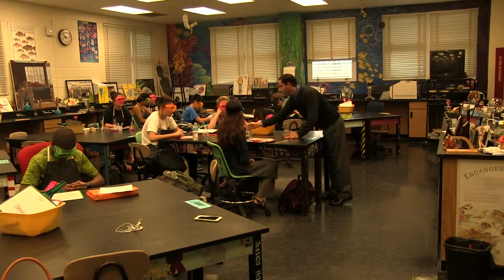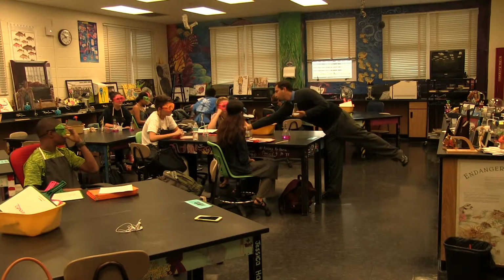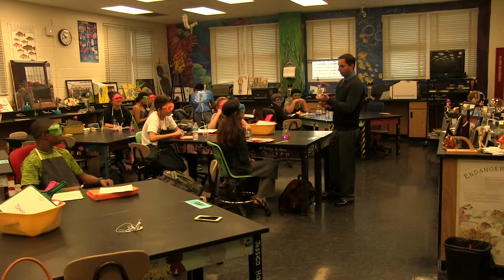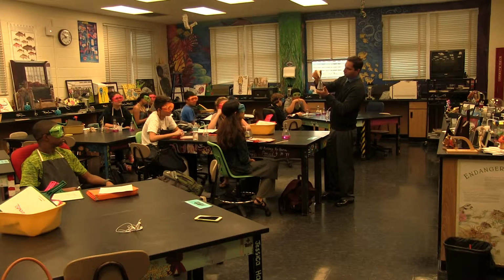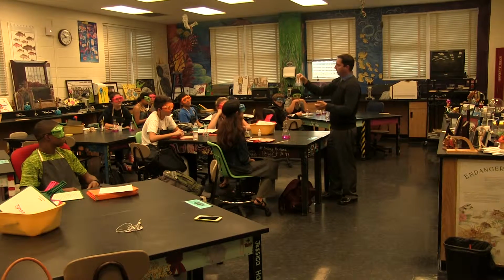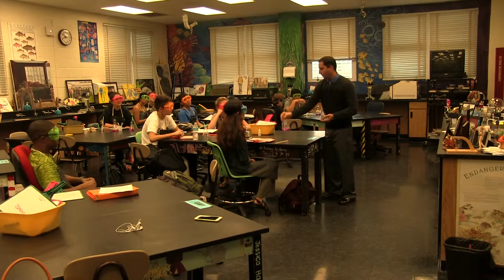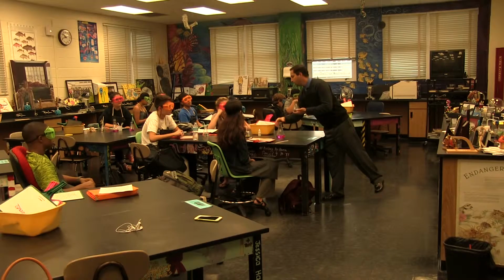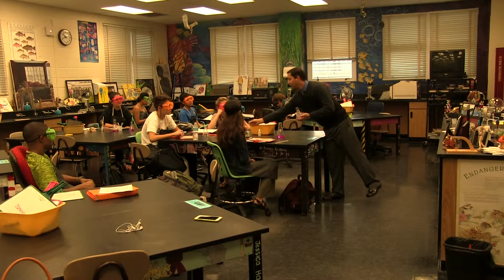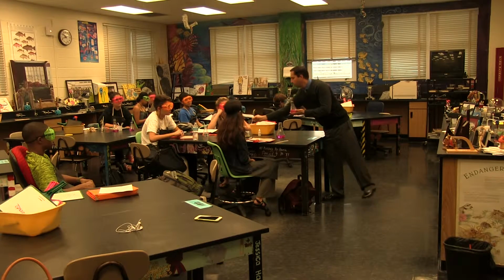If we have water, this is just water, and we put a drop or two of this indicator in, if it's basic, it should show us that color. Put some drops in here. This water, because West Palm's doing such an excellent job, it's just slightly basic. It's just a tad pink. It doesn't match our controls yet, so what we need to add is just a little bit of sodium hydroxide, and it should achieve the color of the control. And right there, a few drops of sodium hydroxide.